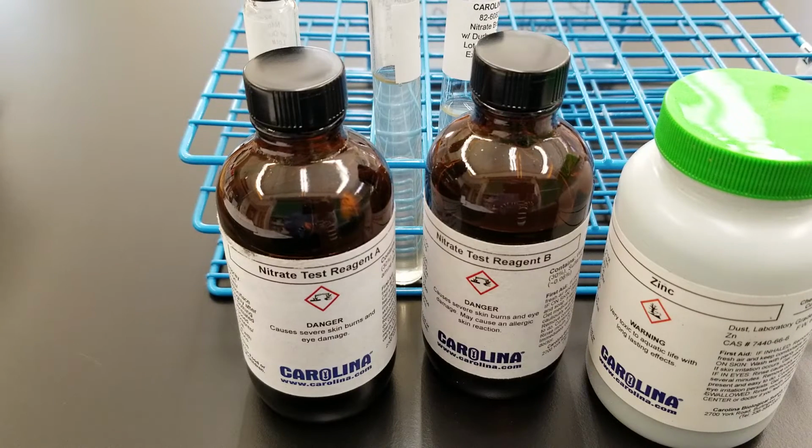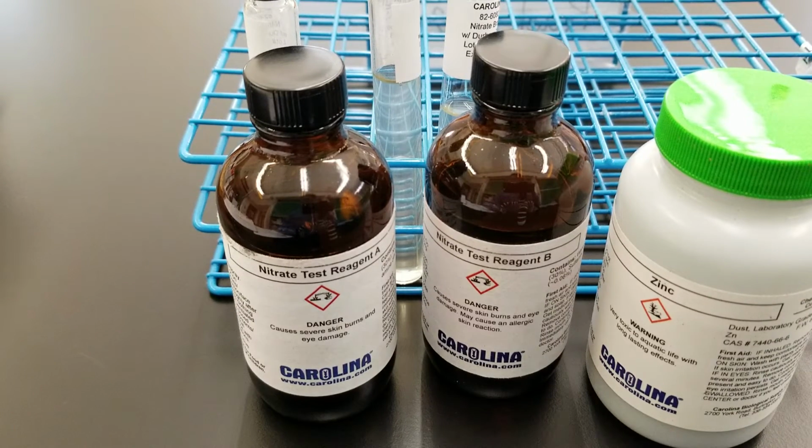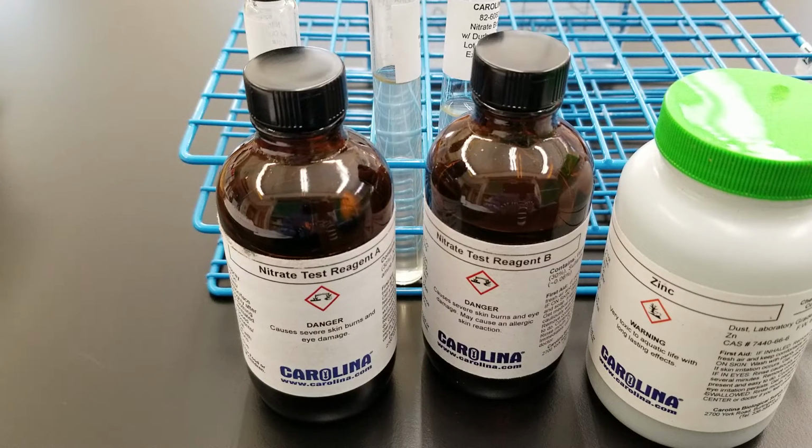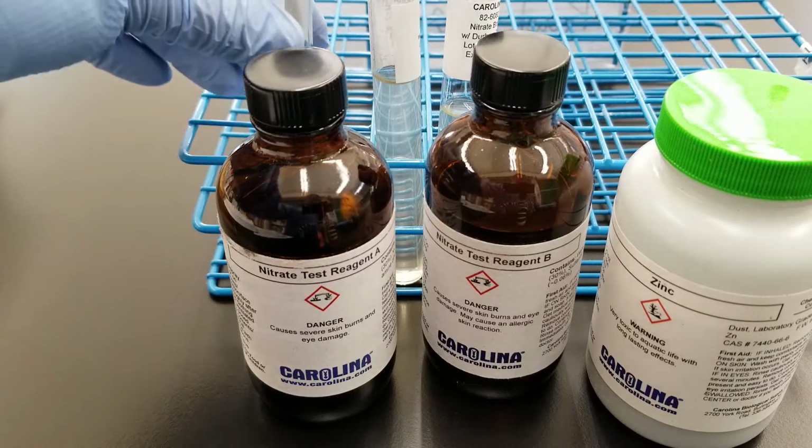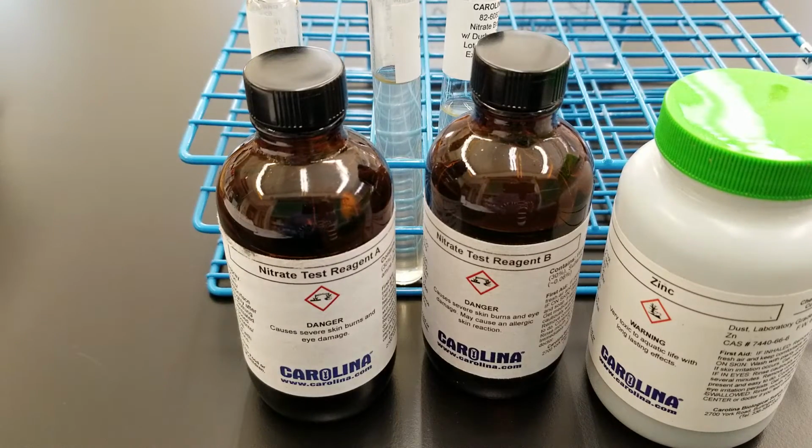In reagent A, we have sulfanilic acid. I'm so sorry, sulfanilic acid, and if nitrite is present, because nitrate was reduced to nitrite, the nitrate was provided by the broth, and if the organism reduced it into nitrite, which is NO2, so nitrate is NO3, nitrite is NO2.